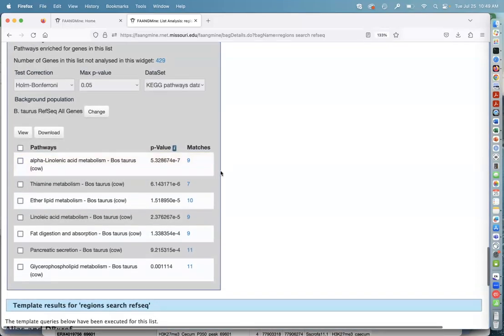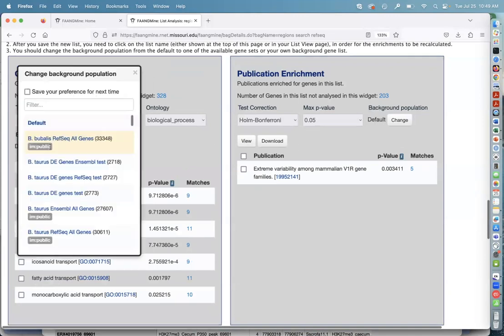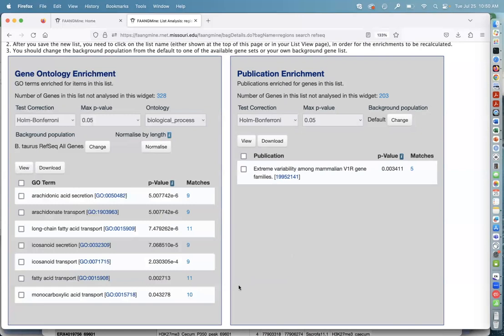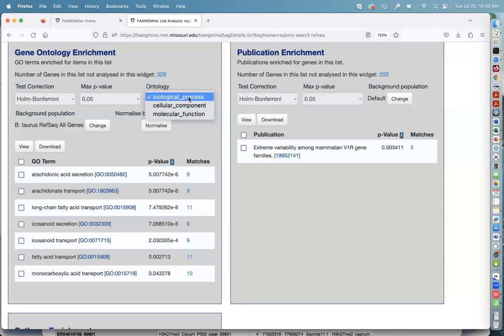And so you can see, if you watched, it doesn't look that much different, but actually the p-values are different. And it's possible that the most marginal things could actually disappear or change. And so then you'd also have to do this separately for your ontology. Yeah, I think that one did change. I think some were lost at the bottom. And then also I forgot to point out before that you have your separate gene ontology divisions.